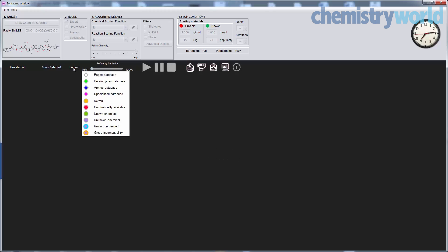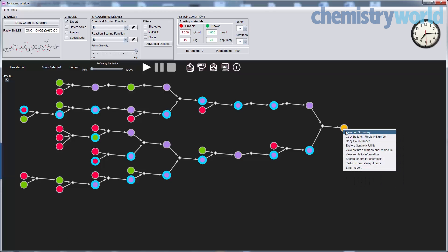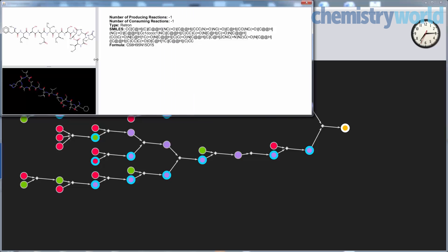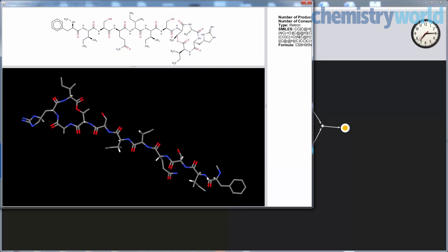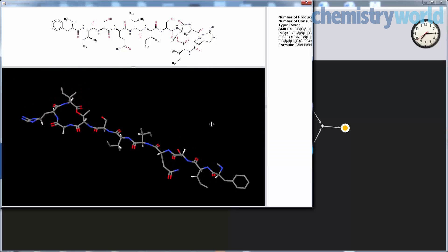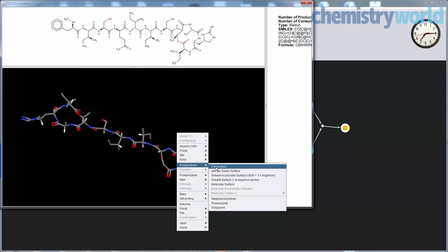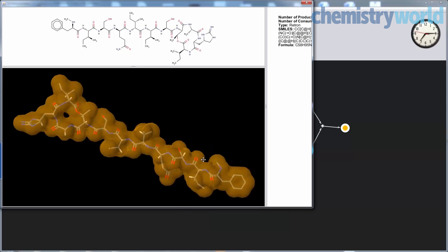The first molecule we are trying is teixobactin, which was published in Nature last year, and the synthesis was just published a few days ago. What you see here is a process that works on 64 computers, 64 cores, and after about eight minutes in real time, Chematica — or Syntaurus — produces the pathway shown here.